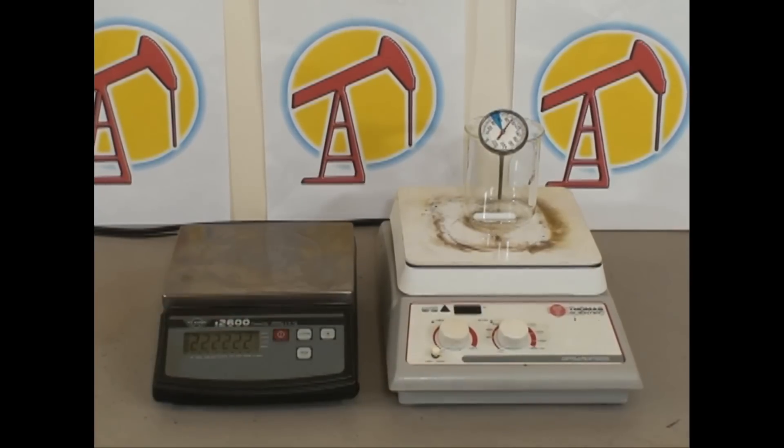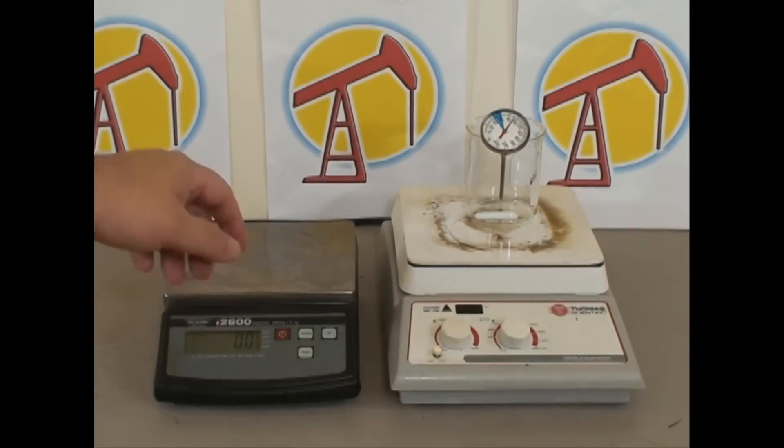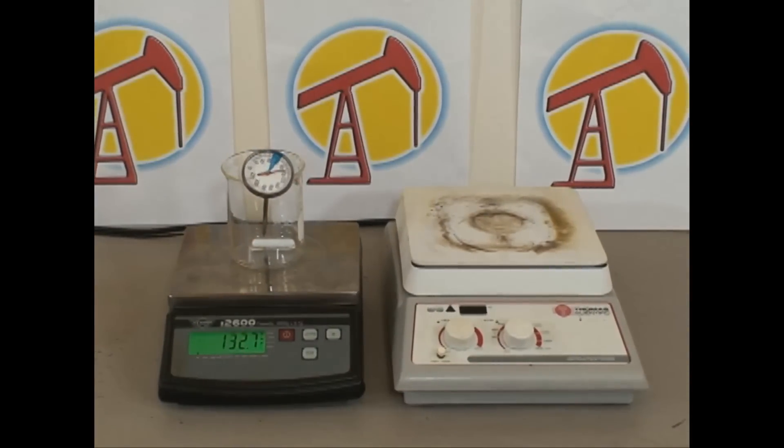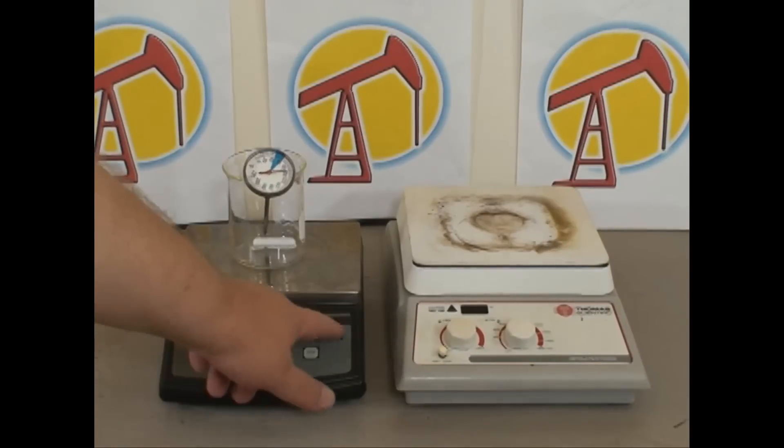We turn on the digital scale and we're going to account for the weight of the beaker, stir bar, and magnetic stirrer by placing them on the digital scale and pressing the zero function key.